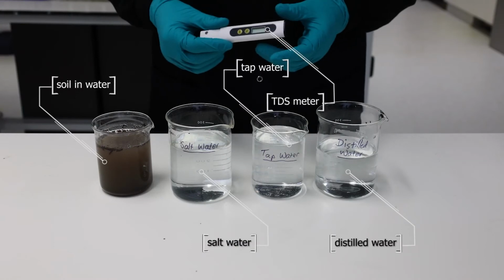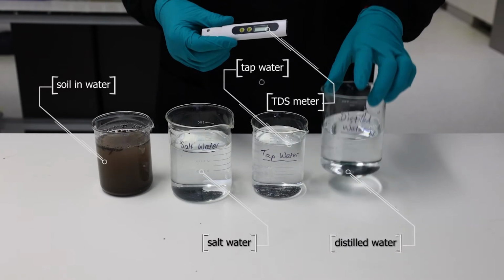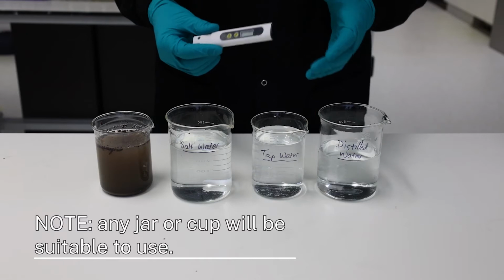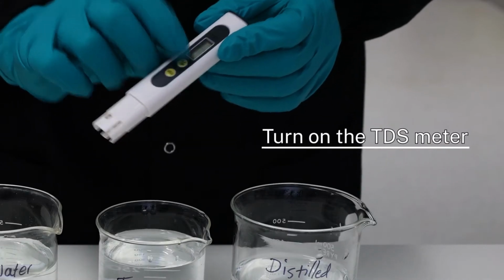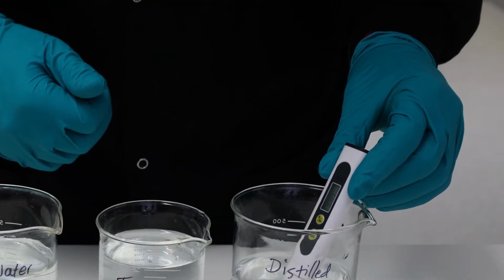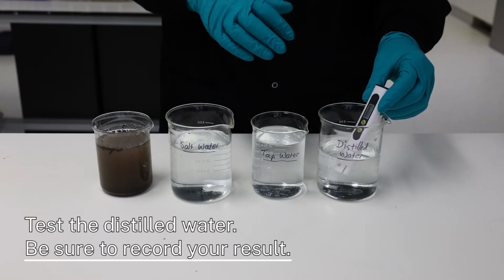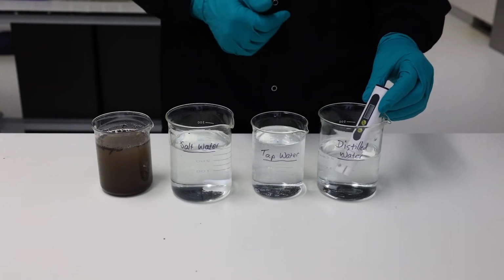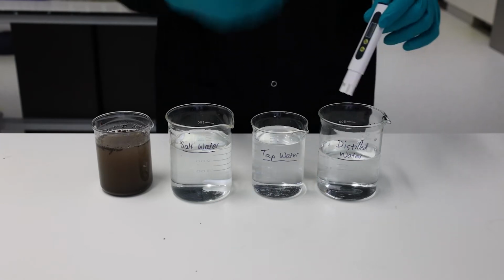Let's run a quick water quality experiment. First, we'll test the levels of conductivity in distilled water, which you can buy from the supermarket. There should be a very low level of conductivity if the water has been distilled correctly. Be sure to record the results. First, we turn on our TDS meter and we put it in the water and read off the reading. Here we're getting a reading of 0, meaning that it has extremely low conductivity, below the detection threshold of the instrument. So that's great, that's what we expect. So it's got a low conductivity because it has a very low concentration of dissolved ions.